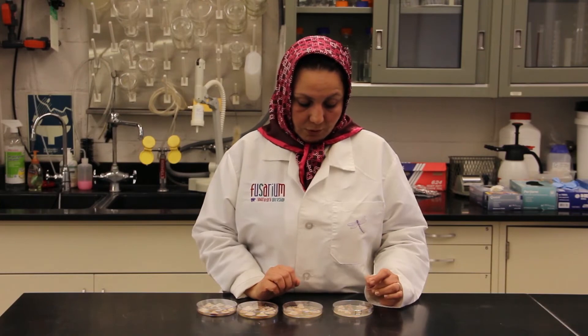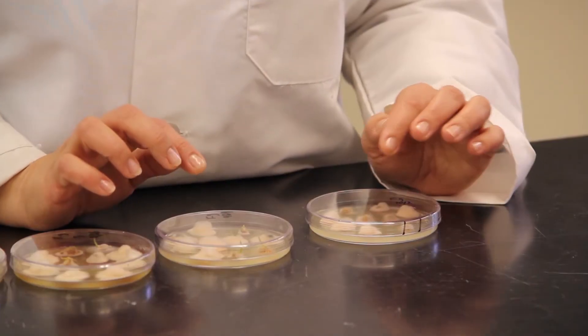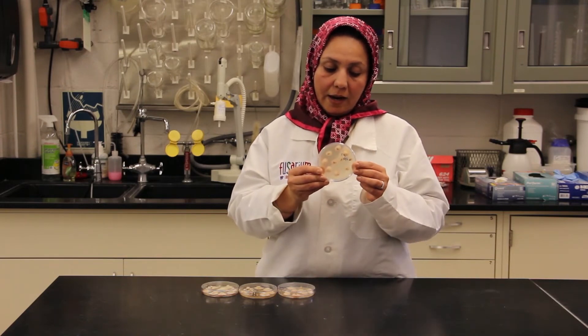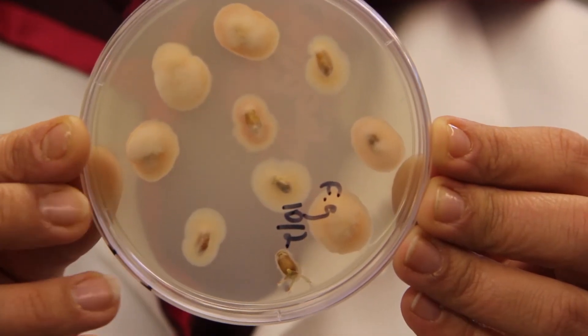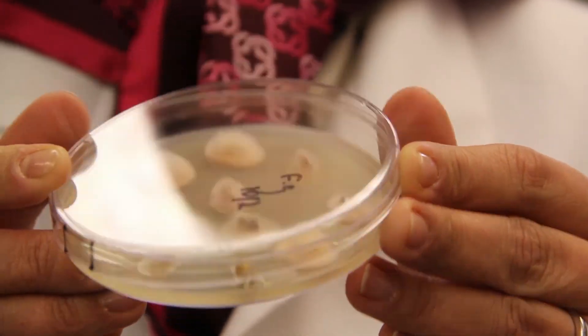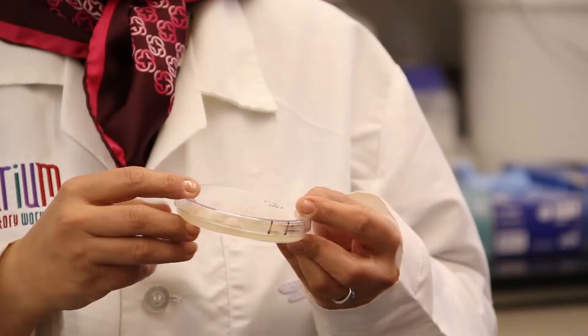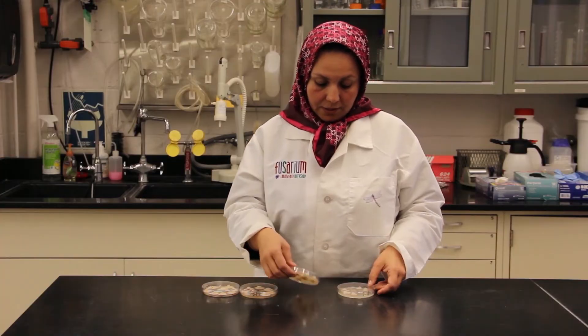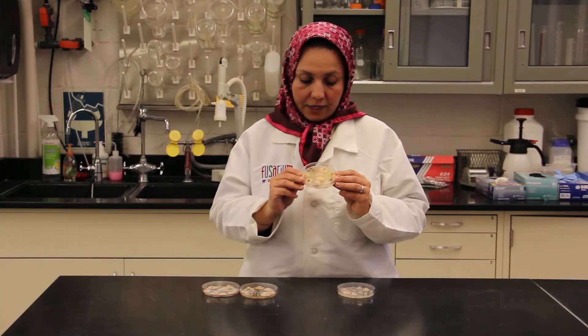This is the plate after five days of plating the seeds. Now you can see the color on the bottom and on the top of the plate. And this is after eight days.